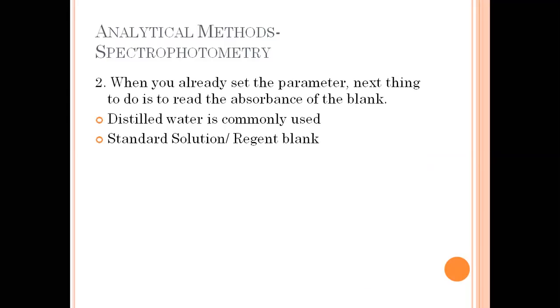Ayan. When you already set the parameter, the next thing to do is to read the absorbance of the blank. So bago ka mag-read ng sample, kailangan mo munang mag-read ng blank. So distilled water is commonly used. Okay, but sometimes we could also use a standard solution or a reagent blank as our blank. So then again, that will depend on the method, on the sample, okay? Or kung ano yung sabi na gamitin mo as blank. But sometimes nga, the most commonly used blank is your distilled water.